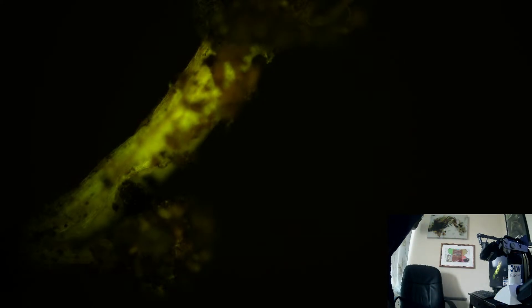Even this small little tiny dandelion, this taproot was going down quite a ways. It snapped when I was pulling it out. I tried to get the lowest root that was nice and small to put on the slide, but they are good miners. They can help with a lot of things. Calcium.